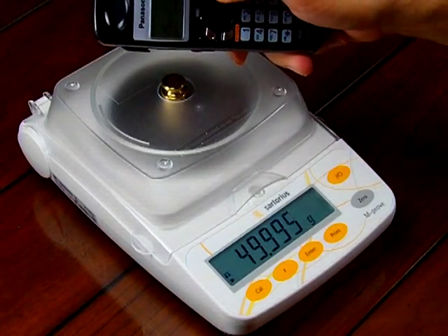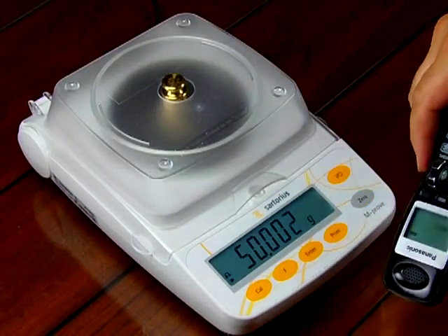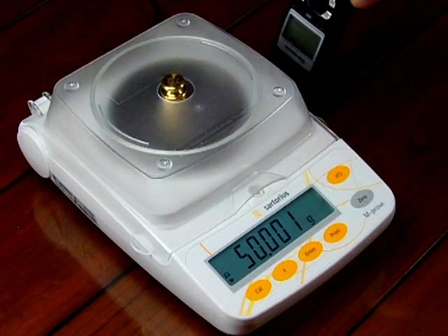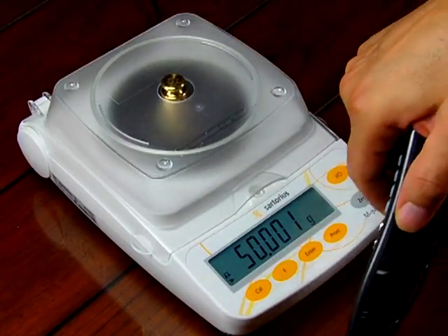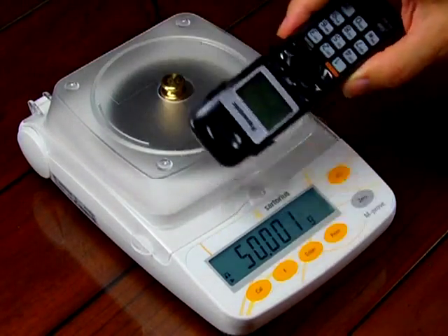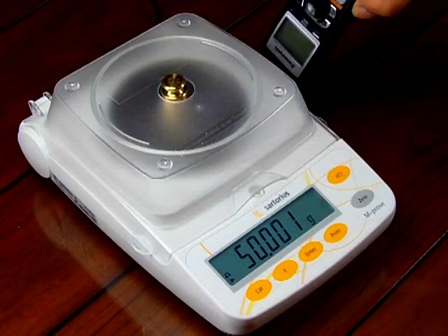Now I'm going to turn off the phone — here's the off button in the right-hand corner. When I turn it off and go around the scale, it's plus or minus one division, and that's within the specifications of the scale. Notice the telephone is off right now. I go around and it's perfectly fine.